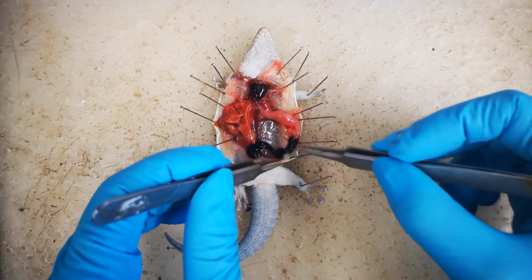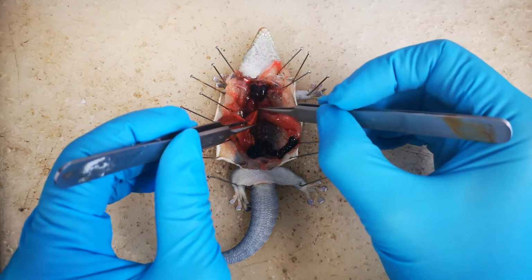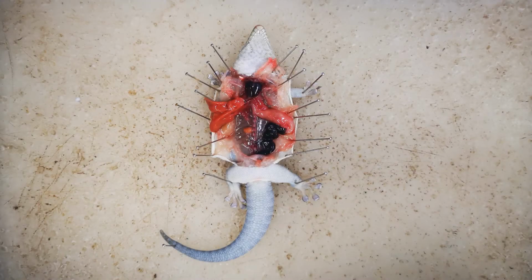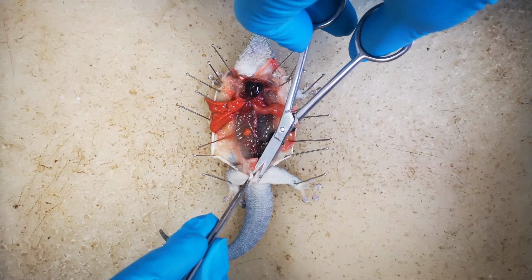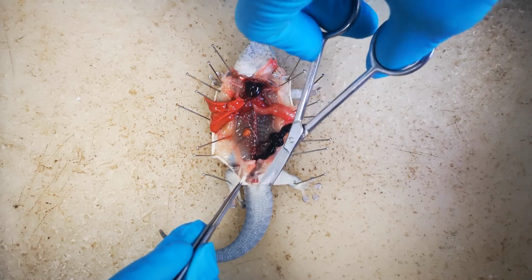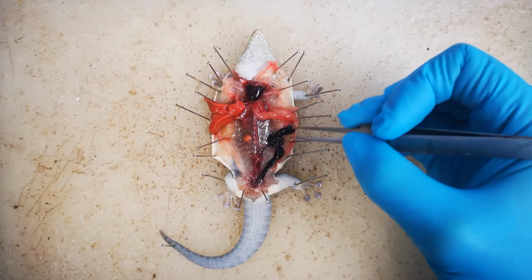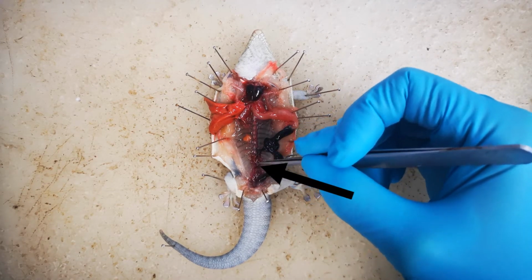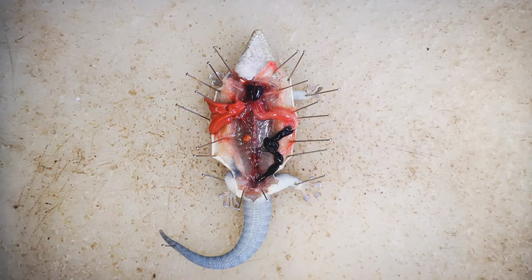We extend the digestive tract somewhat to be able to follow its course. We extend our dissection line posteriorly to the cloaca in order to examine the excretory and reproductive systems. The kidneys are visible as thin strips that lie along the ventral surface of the spine. Because this individual is not sexually mature, the gonads are small.